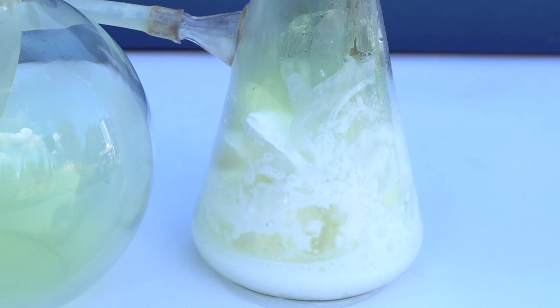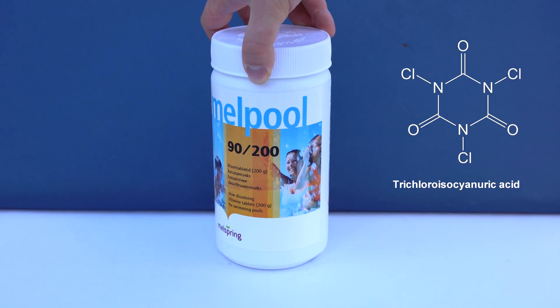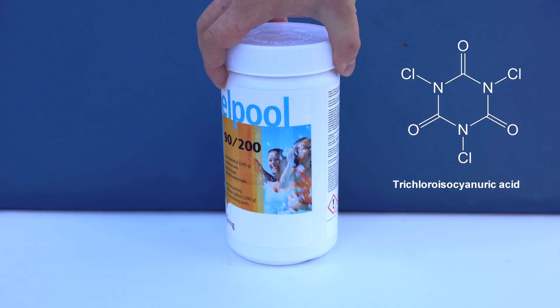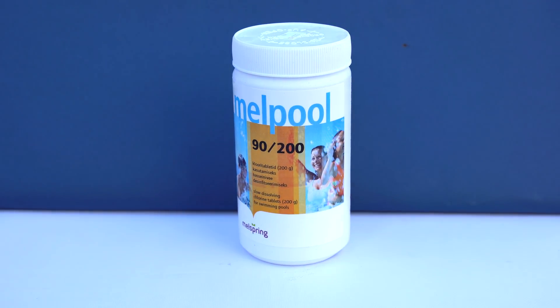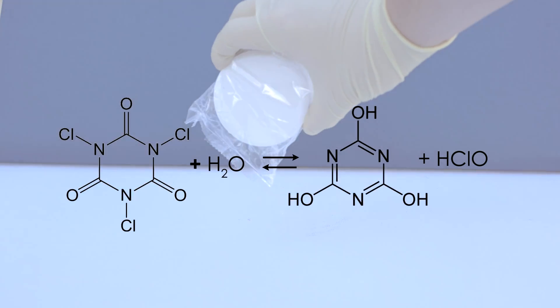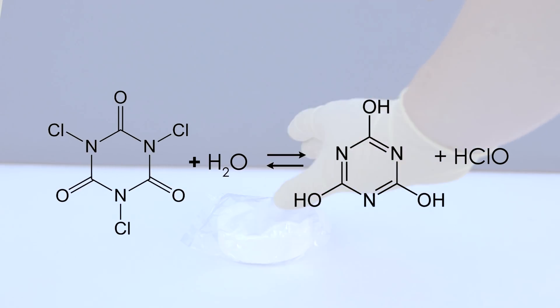For my experiments, however, I choose a different approach, a more efficient method of producing chlorine. As the main reagent, I am going to use trichlorocyanuric acid, which is also used as a disinfectant in swimming pools. When the tablet of this substance is thrown into a swimming pool, it gradually dissolves, slowly decomposing into chlorine and cyanuric acid.